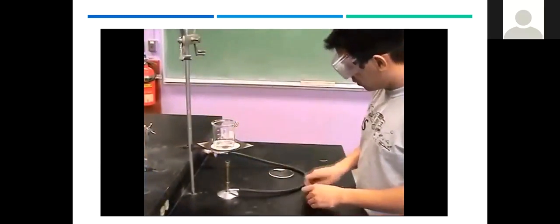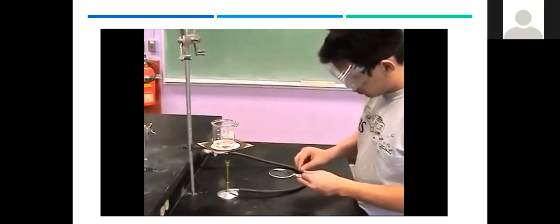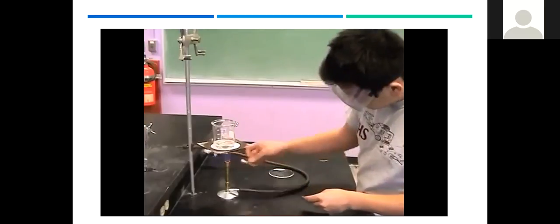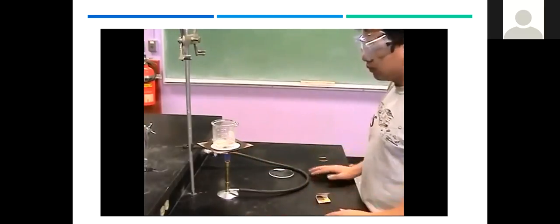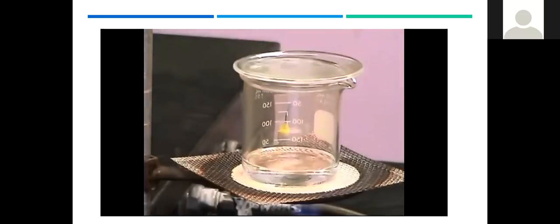An open flame should never be present in the laboratory when flammable liquids are nearby. Such liquids can easily catch fire or even explode. A moment's carelessness is all that is required for a fire to start. If the fire should start in a glass container, such as a beaker, put a solid object over the opening of the beaker. The fire will be smothered.